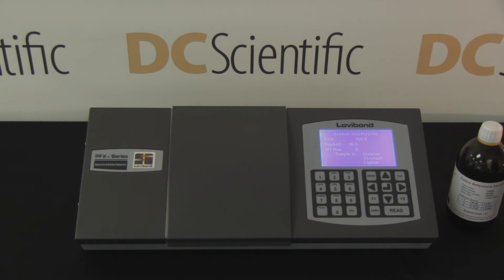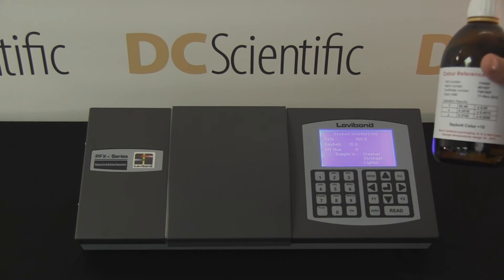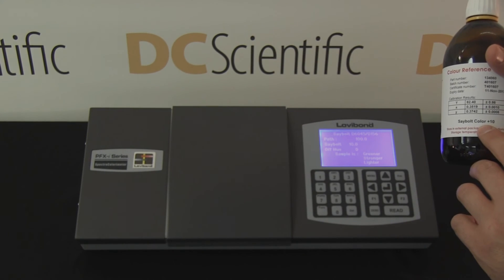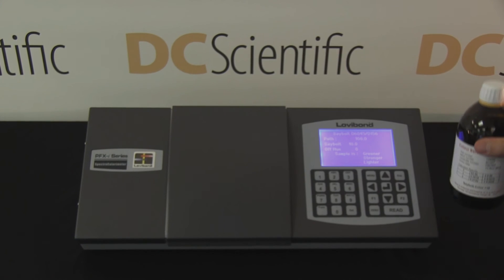The result, in this case a Seibold color value of plus 10, appears on the screen. The technician then checks the result against the ISO 17025 certified reference standard.